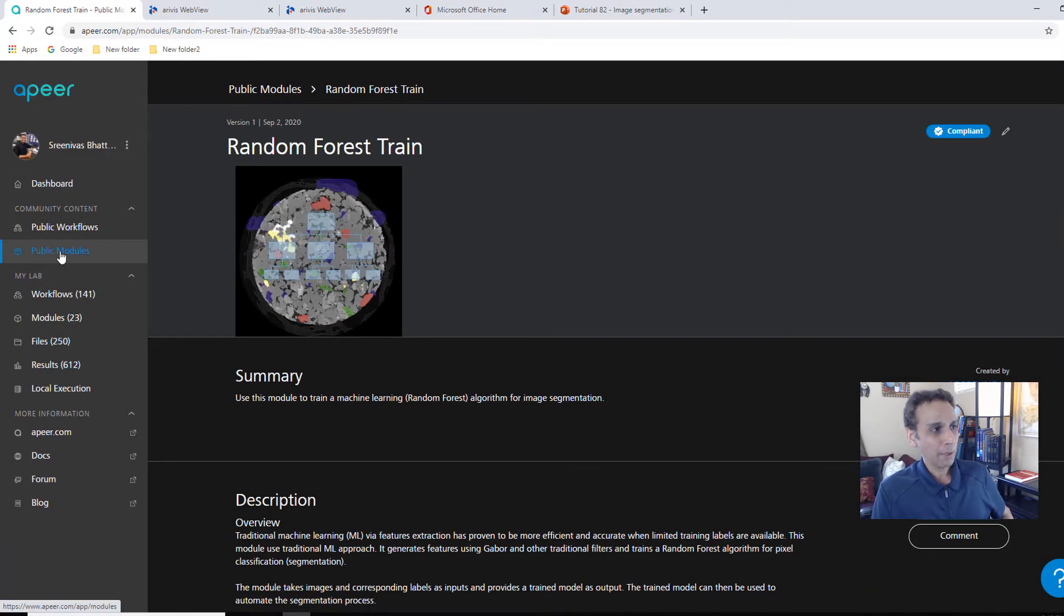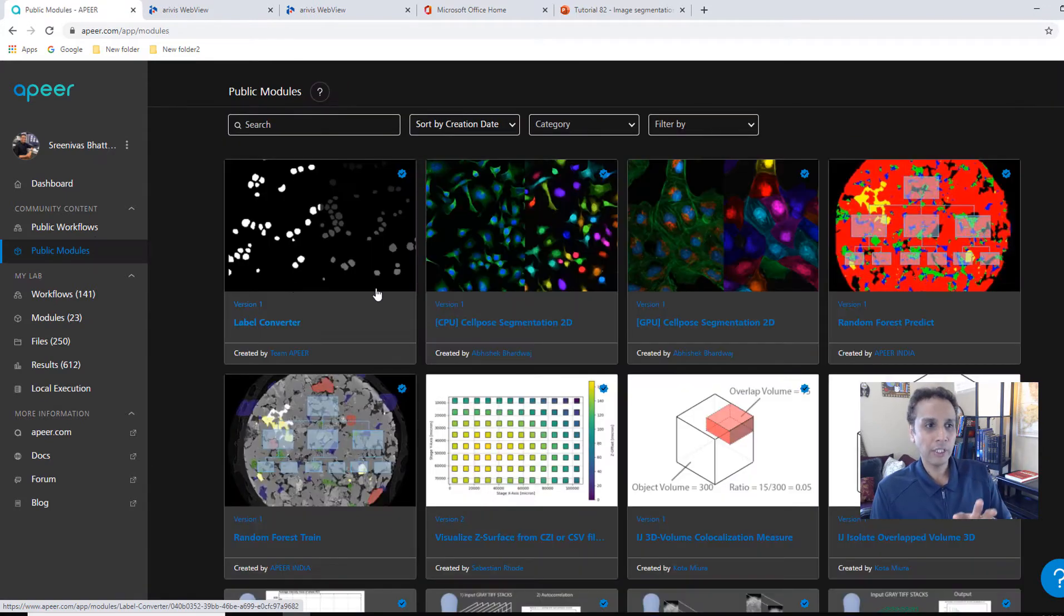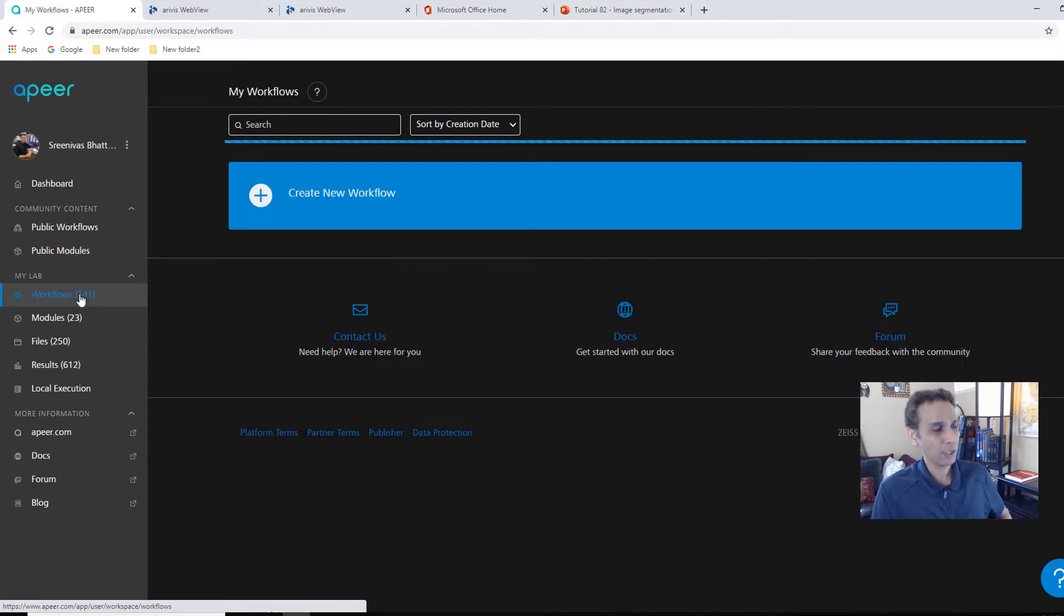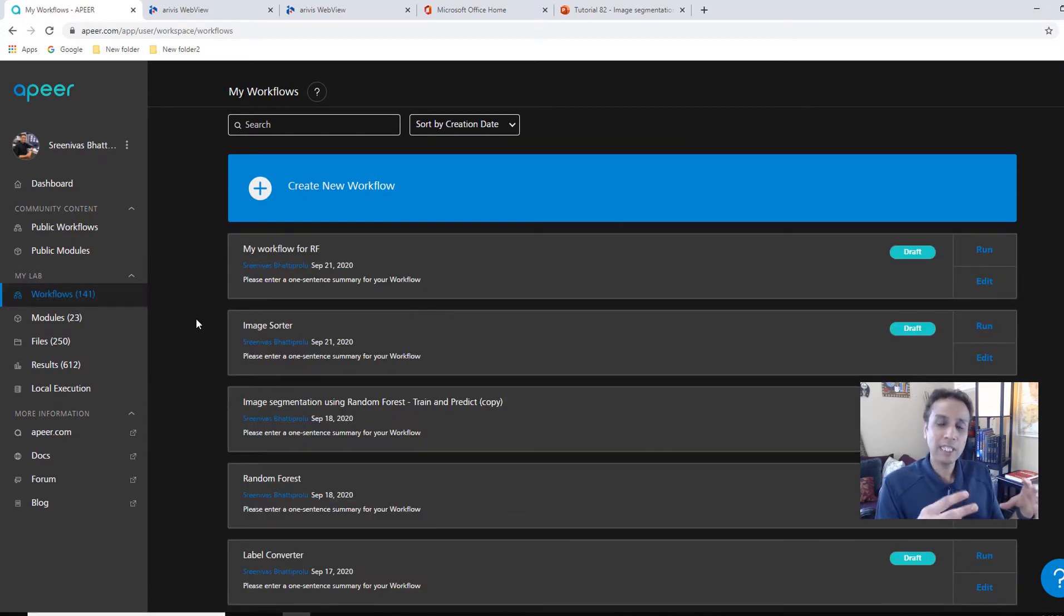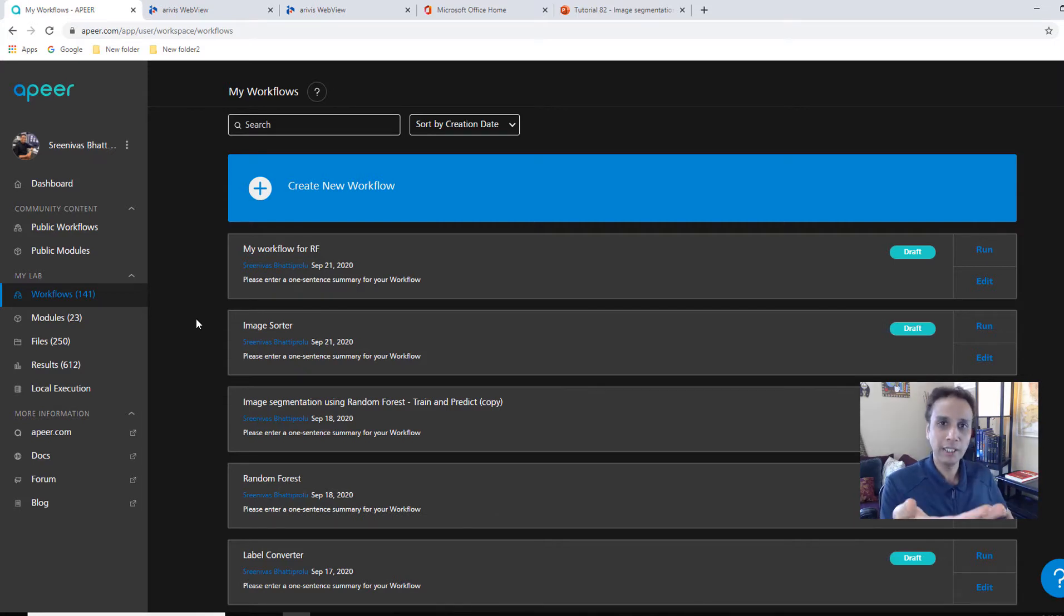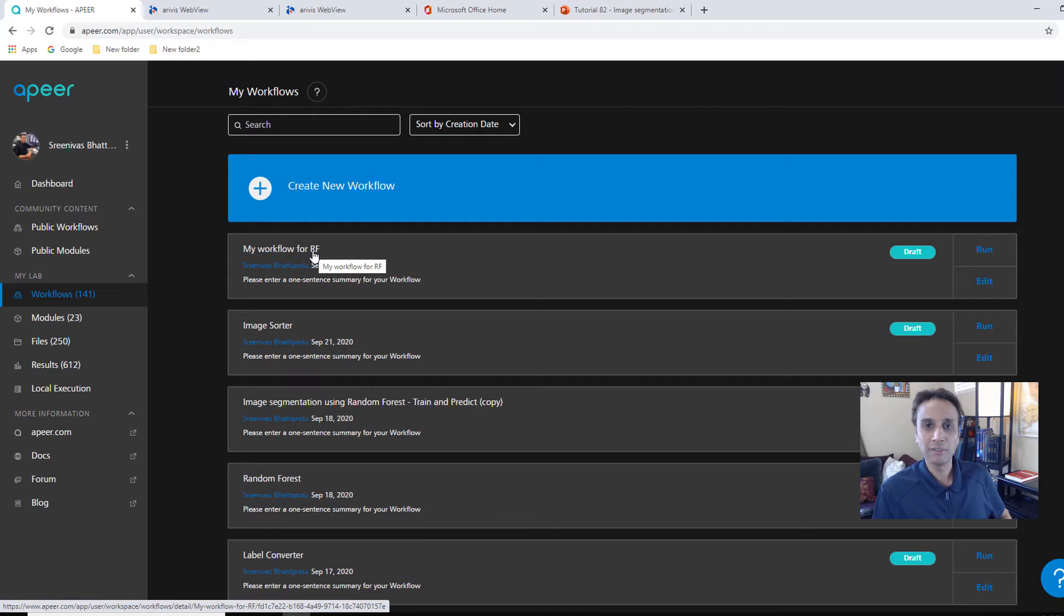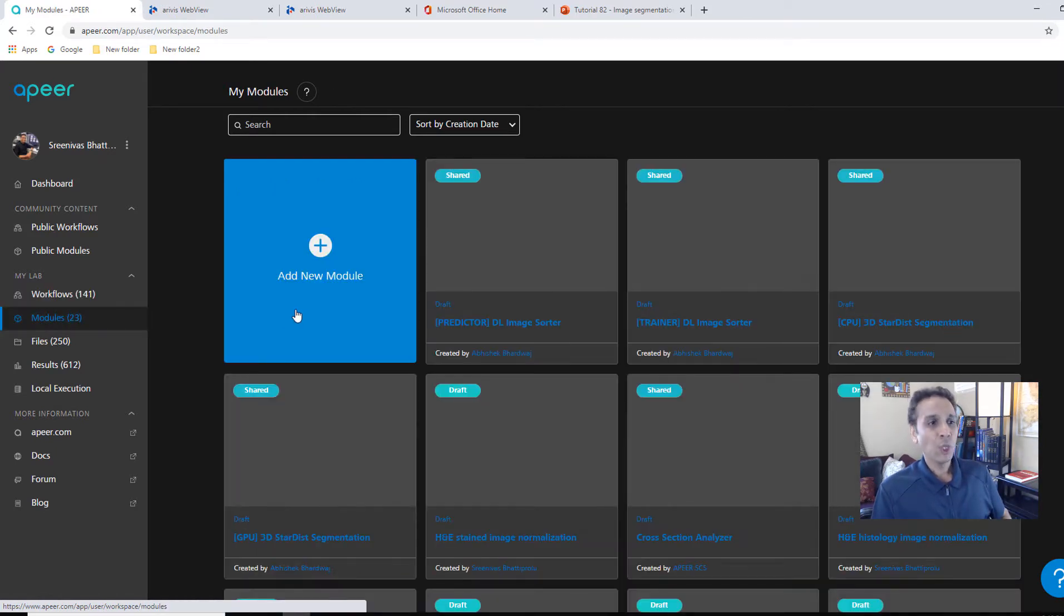And the next module, again, I'm going to select my APEER files. You can upload your images from your computer. Since I already have it on APEER, I'm just selecting these annotations. Where did I get these from? I'll show that in a second. So let's exit this out. I showed you little things quickly. We'll come back. So these are public modules. You can create your own workflows using public modules or private modules.